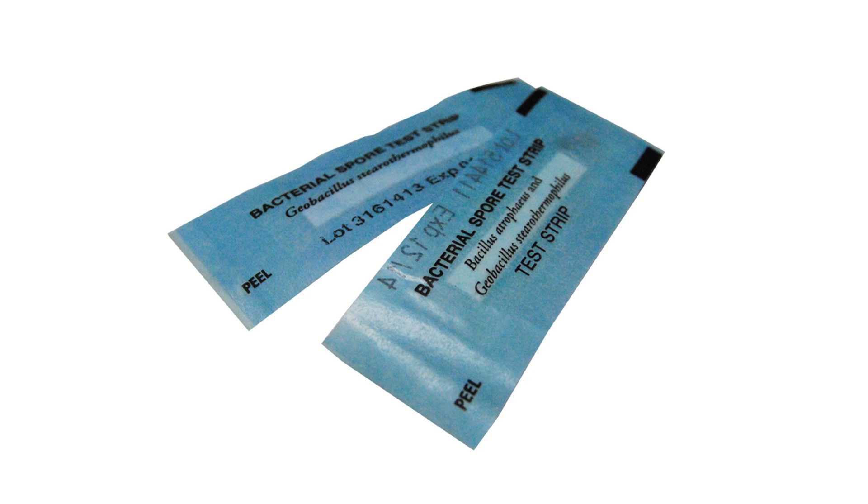The conventional biological indicator for dry heat sterilization has been an inoculated paper strip packaged in a glassine envelope. These biologicals have a certain limitation though. In higher temperature cycles, in around the 180 degree centigrade range, the paper strip and the glassine material can become brittle, and in very long cycles they may start to degrade.